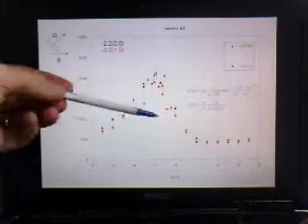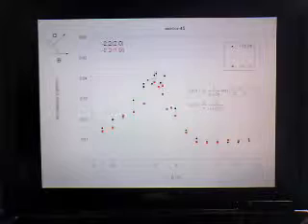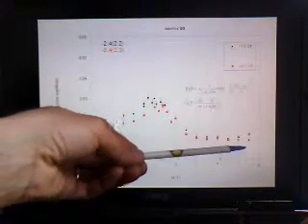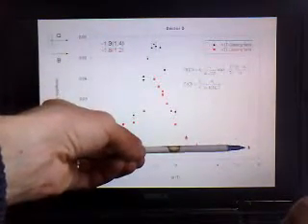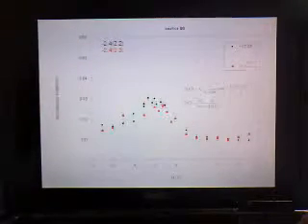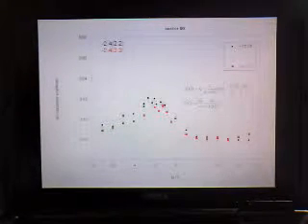Okay, so these are the data for sector 45. The amplitude of the Gaussian decreases. For sector 90, it decreases even further. But at this point, notice the amplitude here at large field actually increases each time. So we can go back to that here. Sector 0, 45, and 90. So there's a general increase as you go from sector 0 to sector 90 in the amplitude of that Gaussian function at the highest fields.